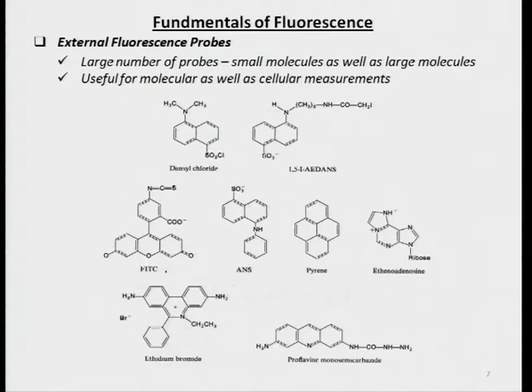The idea is these molecules bind the protein, and therefore the protein fluorescence will change. So these are not only useful for molecular purposes. Many of these probes are small and they are fairly hydrophobic. So you can actually use these for proteins that are inside cells. So they are very, very useful.